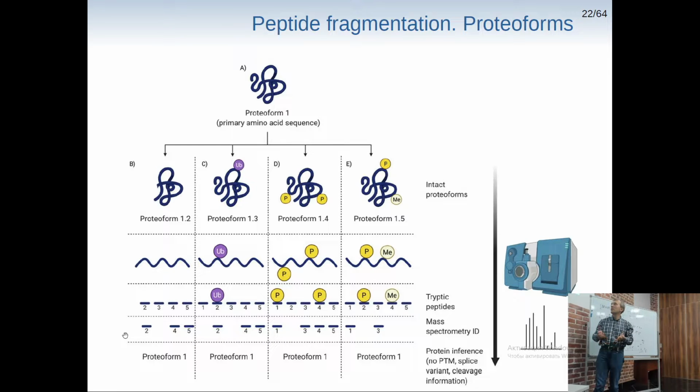Due to different problems, even if you can identify the proteins, it's not always possible to get all the possible post-translational modifications, right? How can you overcome this problem? For instance, you know that there is a difference in this given protein, but the concentration of this protein is not changing in any meaningful way. It's just the same in your control group and in your experimental group, but somehow by different means you know that this is a protein which has to be the problem.